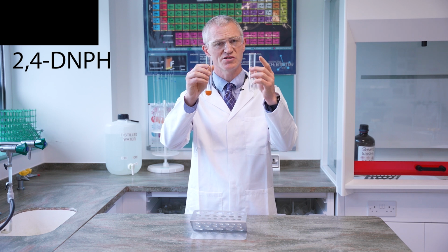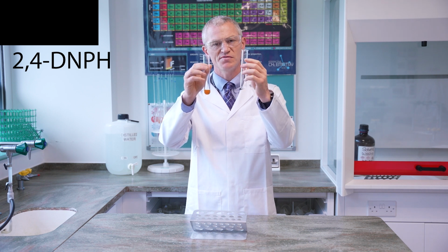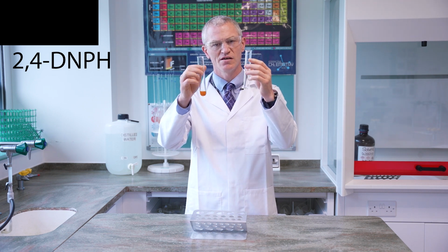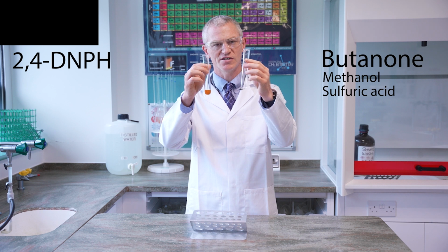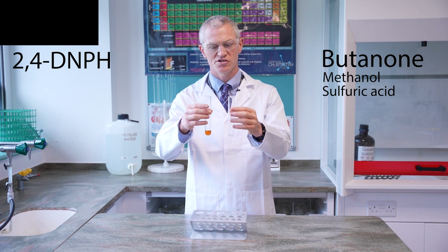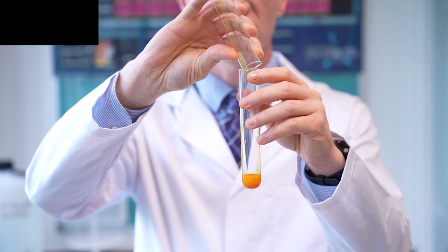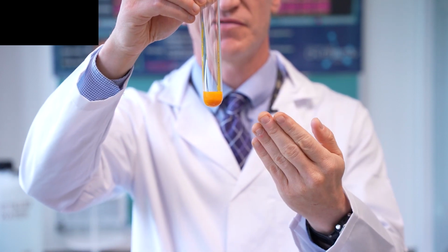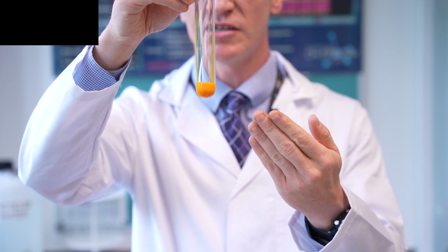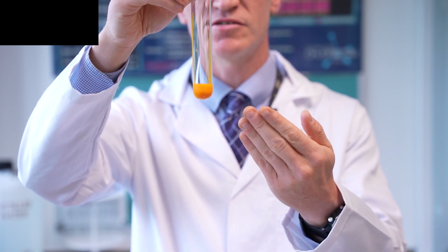So when I say carbonyl, precisely, this is a test for a carbonyl that occurs in a ketone or an aldehyde. So we've chosen a ketone to put in this boiling tube, and that is butanone. And we've also put in the other two reagents, which is methanol and sulfuric acid. And together this is known as Brady's reagent. All you then do is take the two samples and then you add them together. You see straight away that the precipitate is produced, okay, and you have this orange kind of precipitate. Remember, it can also be yellow depending on what it is, and you have that precipitate produced, which proves you have a carbonyl inside your molecule.